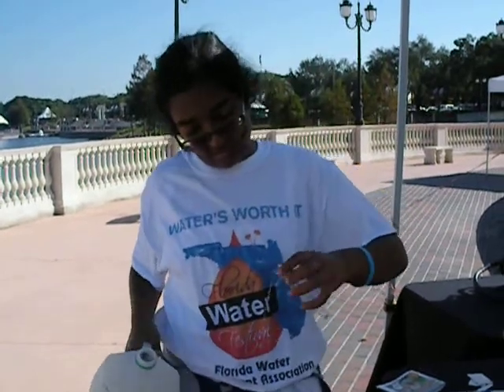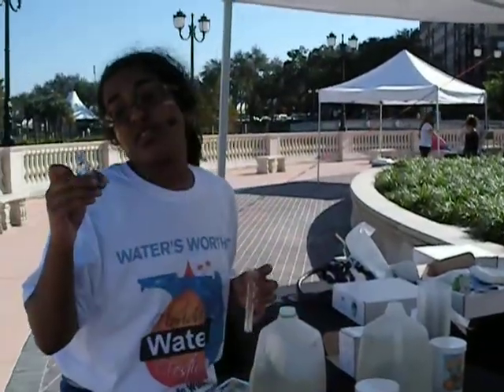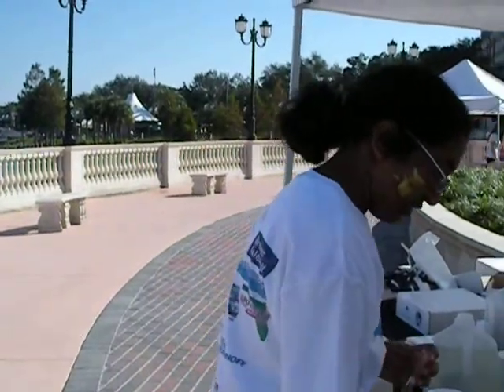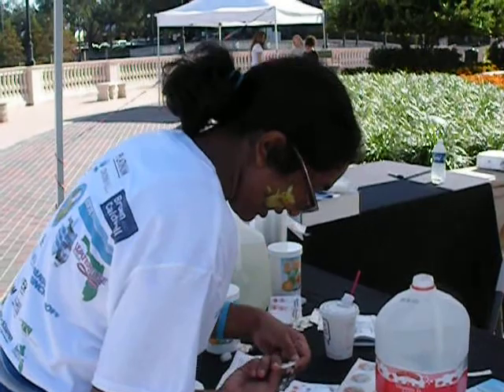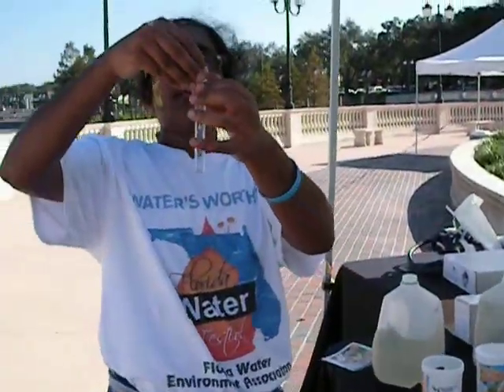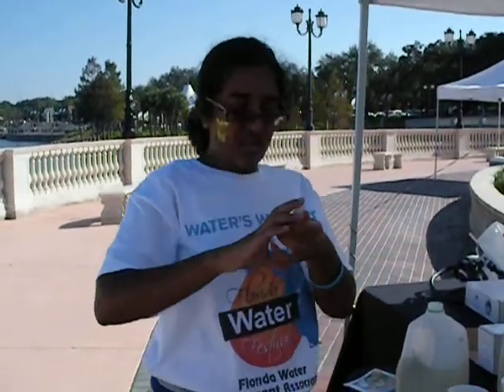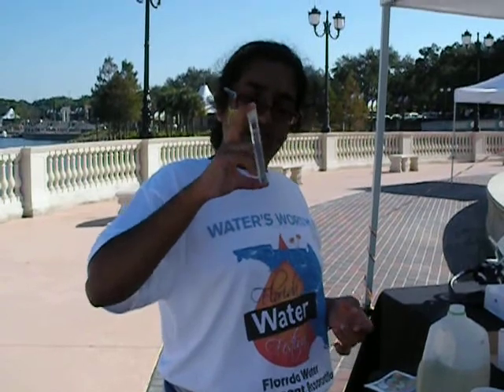A little too much. And we take one of these tablets, which has pH, and it comes out of the container. We drop it in there and shake it.